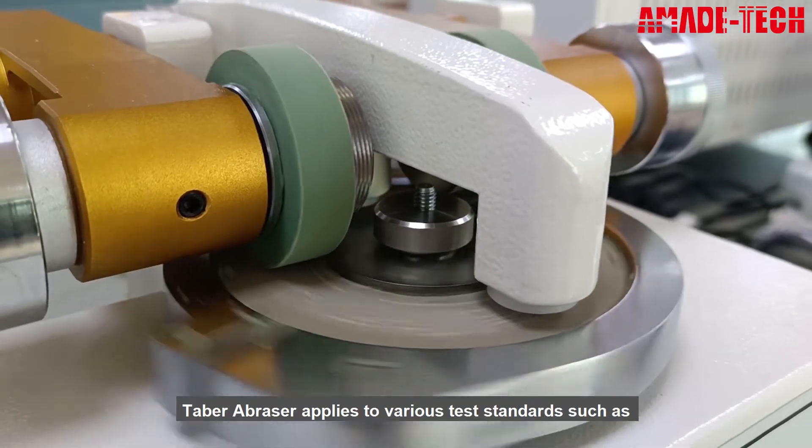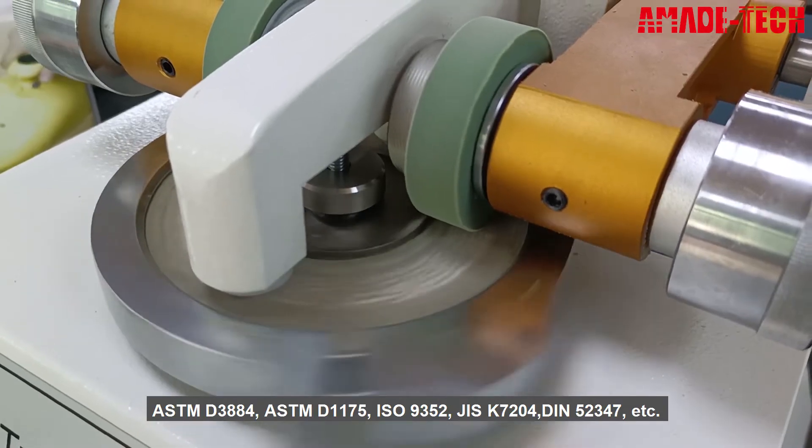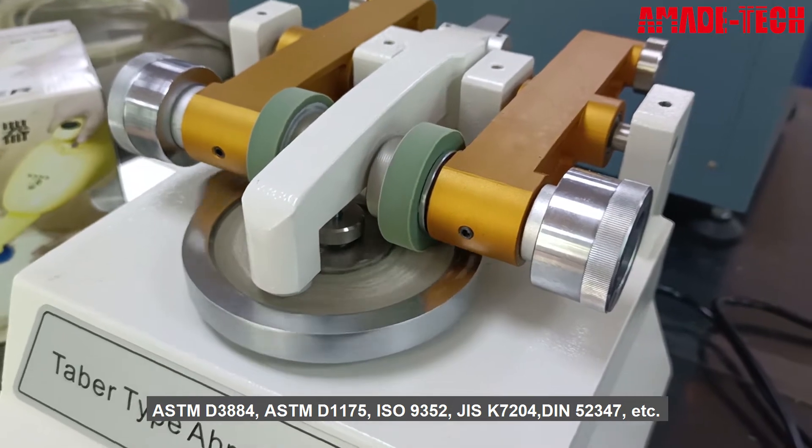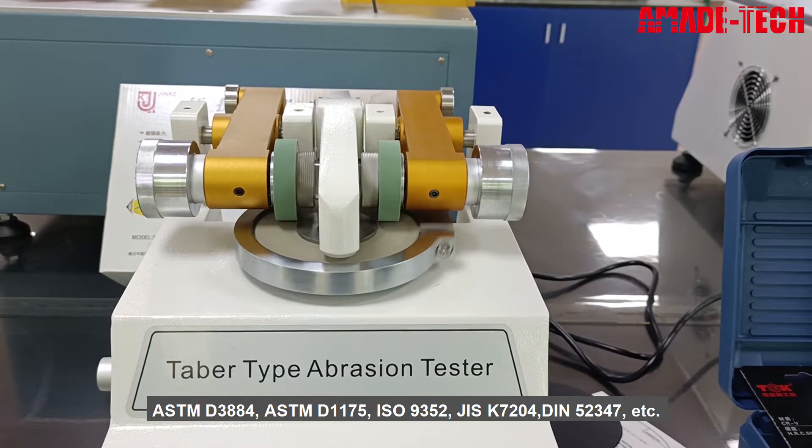Tabor abrasor applies to various test standards such as ASTM D3884, ASTM D1175, ISO 9352, JIS K7204, DIN 52347, etc.